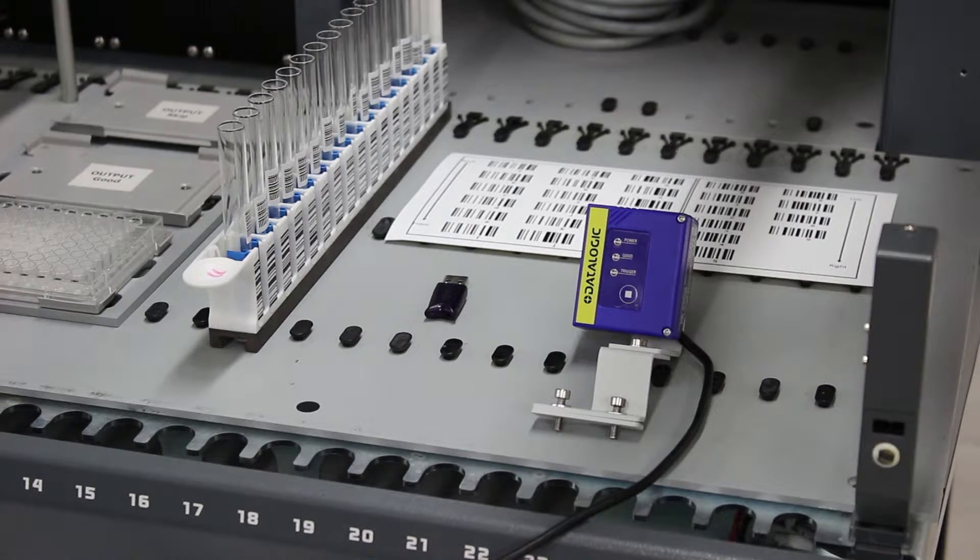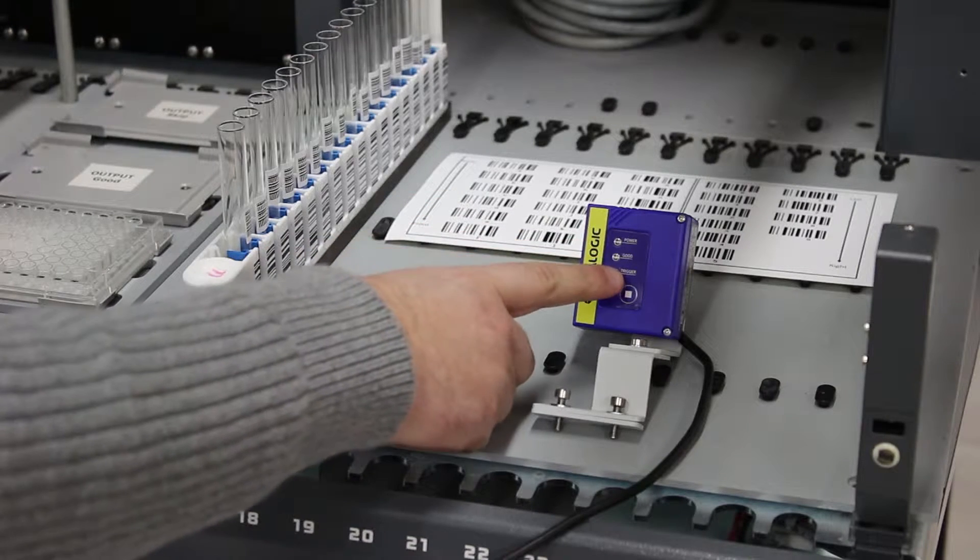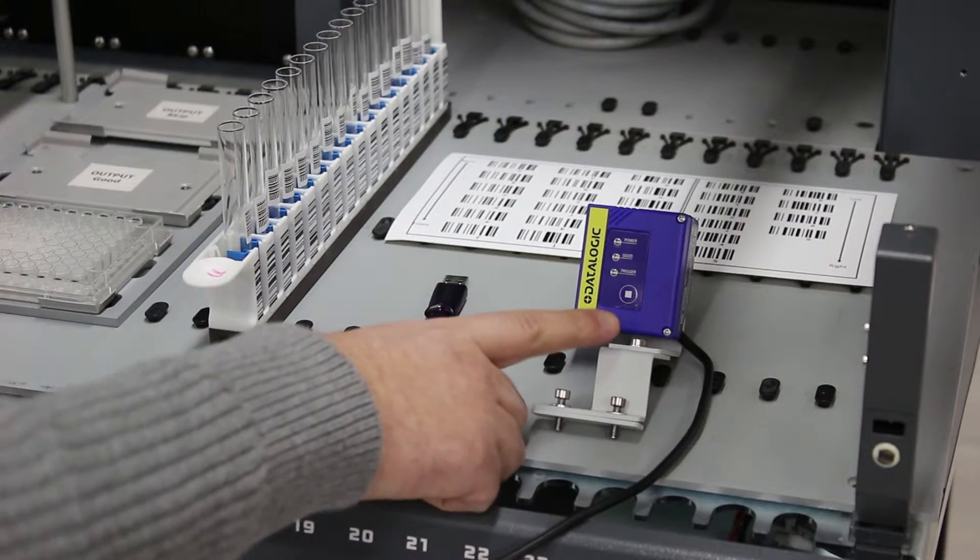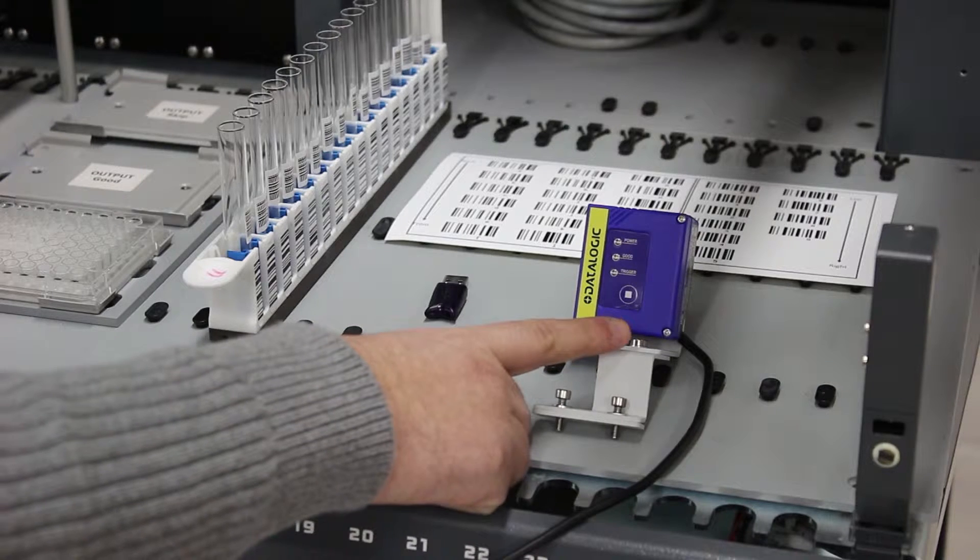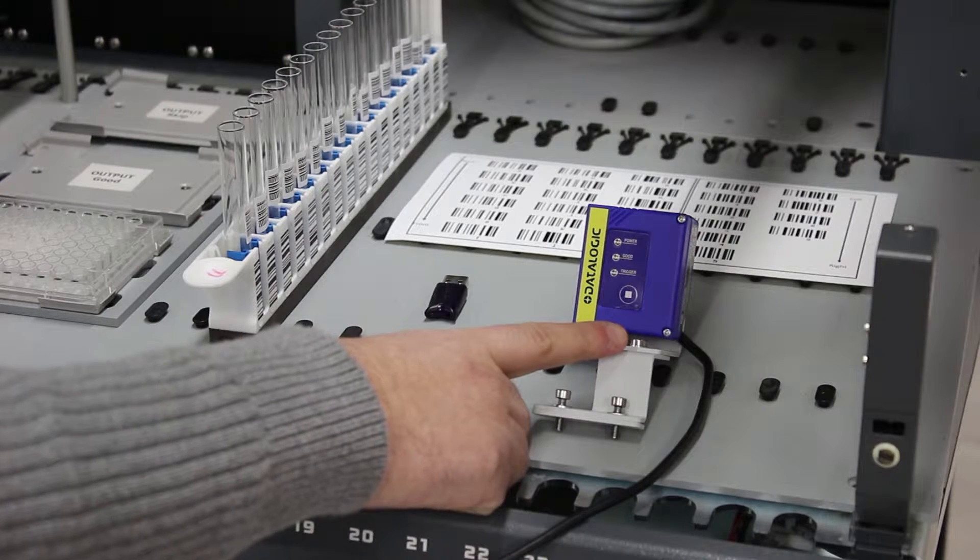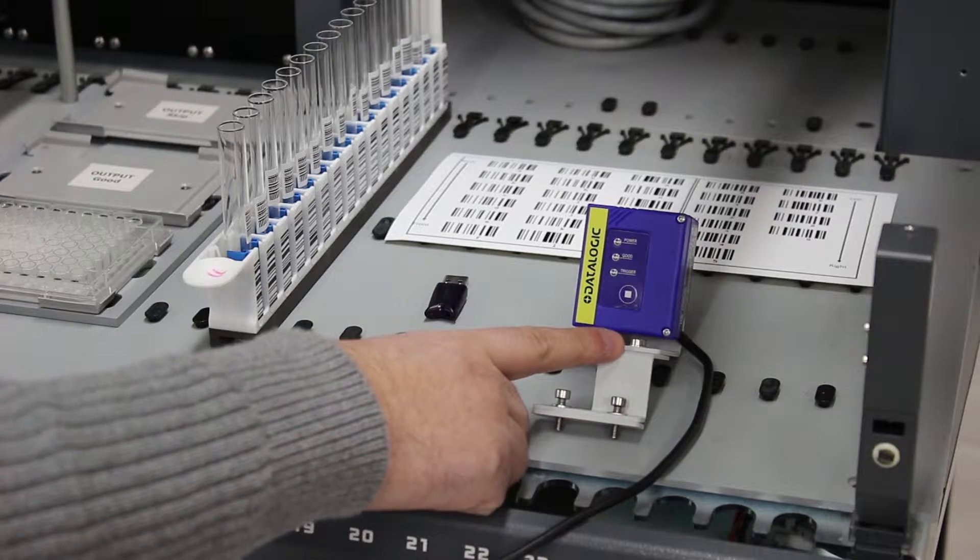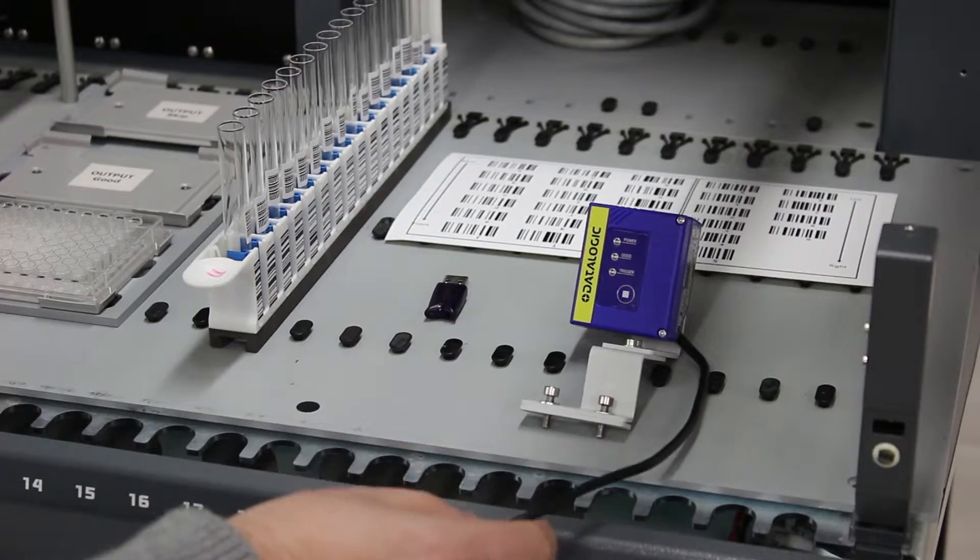It is composed of the following parts: a barcode reader, an adapter for attaching the barcode reader to the EVO work table, and the attached USB cable.